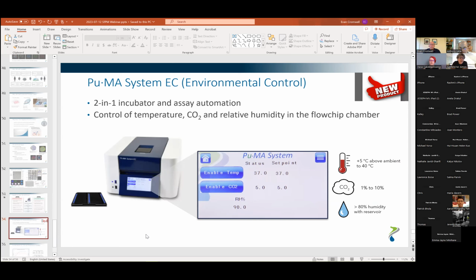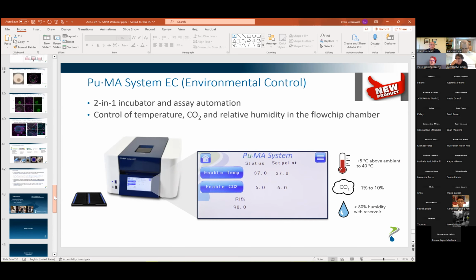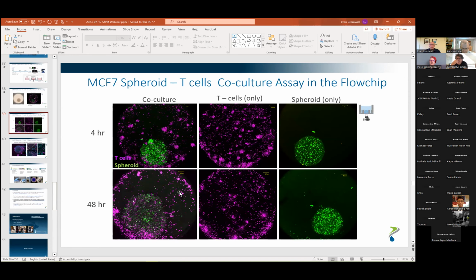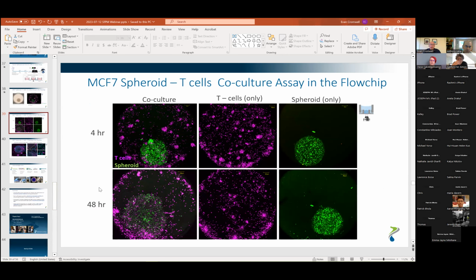Okay. And then one thing you sort of touched on after I'd asked the question, I wasn't quite sure of the full answer. Let's say you have a mixed population of cells in a particular organoid. Can you use distinct markers and follow over time the differential sensitivity of the two cells to the particular drug in there? So you can use different markers. There are different live cell stains. For example, here these are two different cell tracker stains, and as the cells die, if you're looking at viability and differential viability, you would see the cells go away and the cell count reduce.